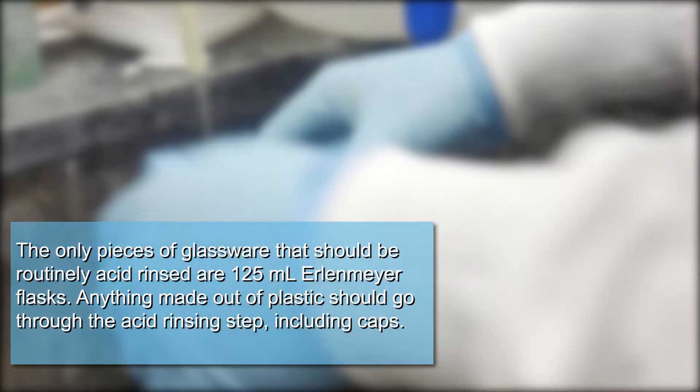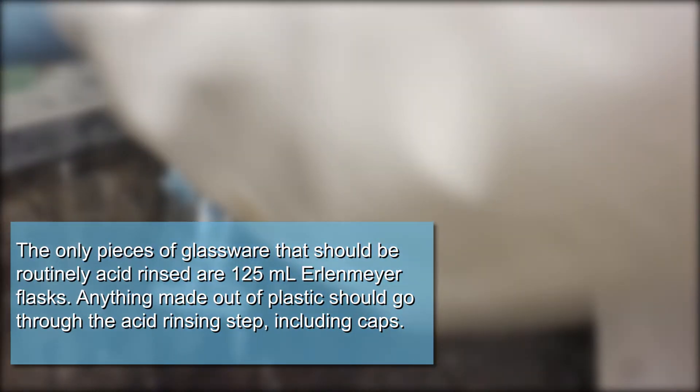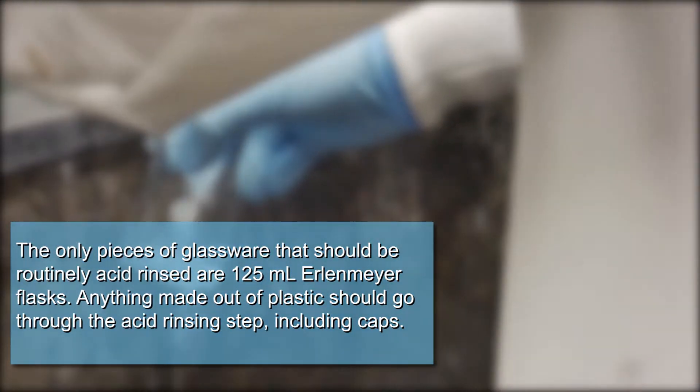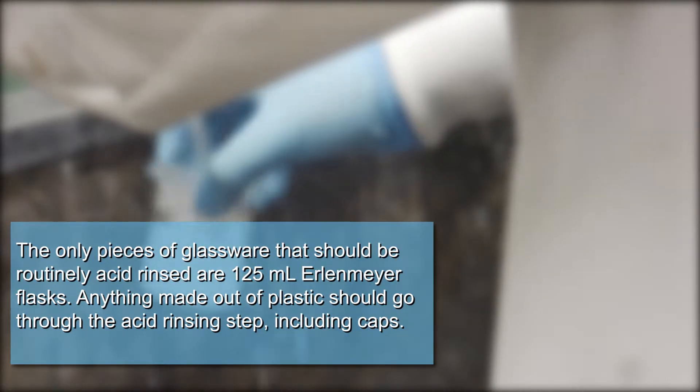The only pieces of glassware that should be routinely acid rinsed are 125 milliliter Erlenmeyer flasks. Anything made out of plastic should go through the acid rinsing step, including caps.